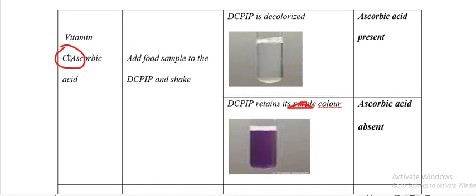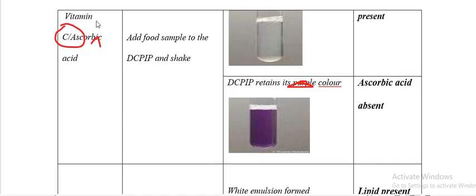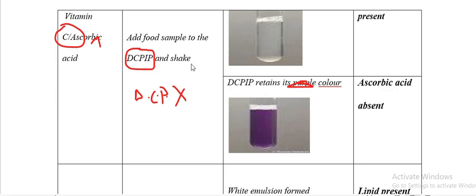Common mistakes with vitamin C: writing 'vitamin' and forgetting C, or writing vitamin K — that is wrong. DCPIP should be in capital letters, not with abbreviation dots. Mixing small and capital letters is also wrong. Most students begin with the food sample, which is wrong — DCPIP must be put into the test tube first, then the food sample follows.